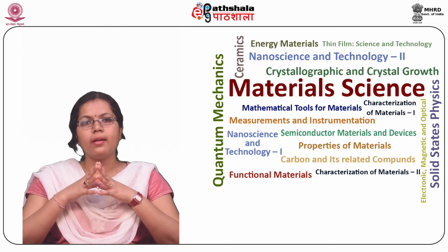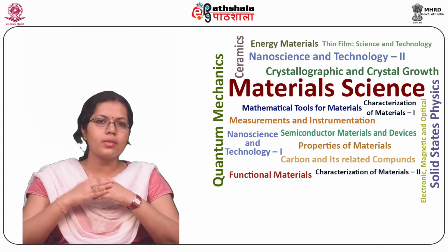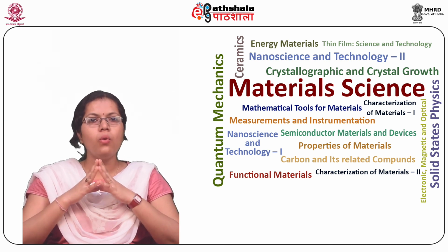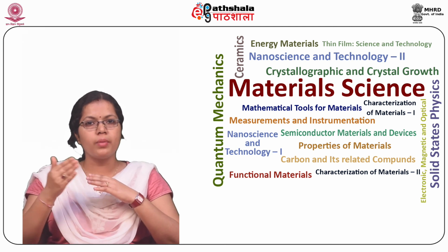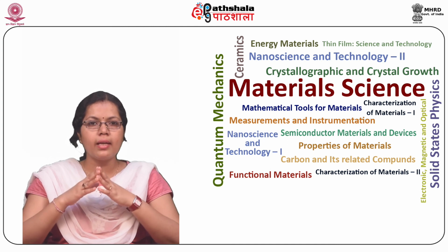The probe head in confocal Raman microscopy works on focusing laser light onto the sample by using a microscope objective, and the pinhole will refocus the backscattered Raman signal, which makes it behave as a spatial filter. After that, the signal will be collected on a CCD detector to create a spectrum.